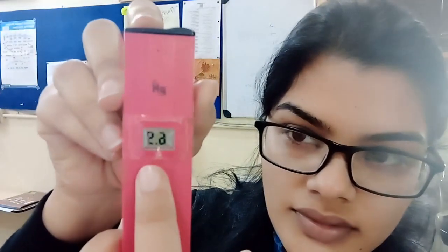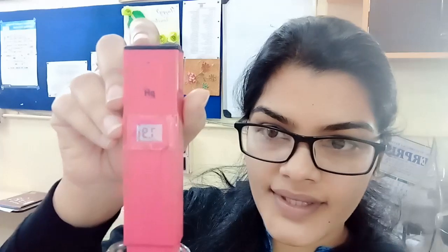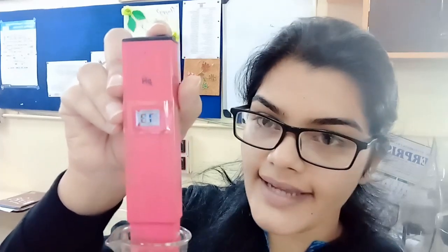So now we will see how to measure the pH of a particular solution. We will first power on the button. We can see the display box. I have taken a water solution. We will dip it. So we can see the reading, which is slightly alkaline. So this is how we can measure the pH of a particular solution by this pH meter.